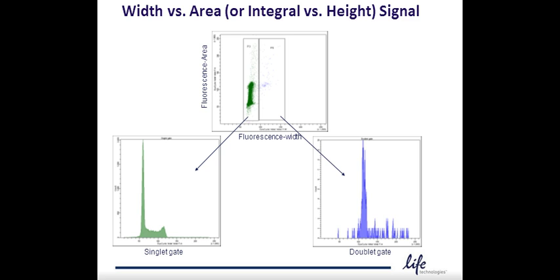In the ideal flow cytometry analysis, the suspension of cells is free of aggregates. However, that's rarely the case. Here is the pulse processing approach, where the management of aggregation is determined by the altered electronic pulse shape. Again, this has some limitations.